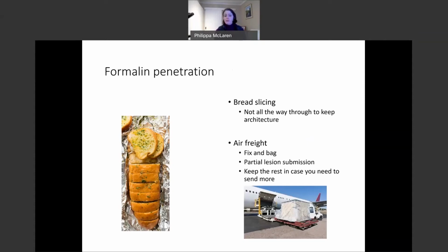You can also photograph the lesion, and we can then look back to that as we look at the fixed tissue when everything has shrunken and become brown and leathery.